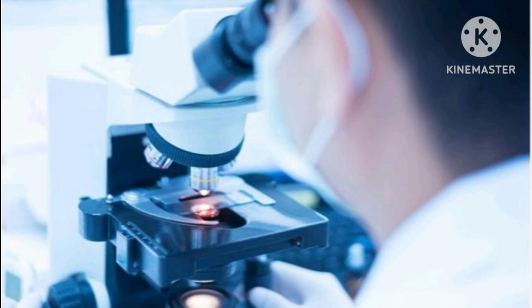A microscope is a scientific instrument that uses lenses to magnify objects too small to be seen by the naked eye. It allows scientists, doctors, and students to observe microscopic structures like cells, bacteria, and tissues in vivid detail.